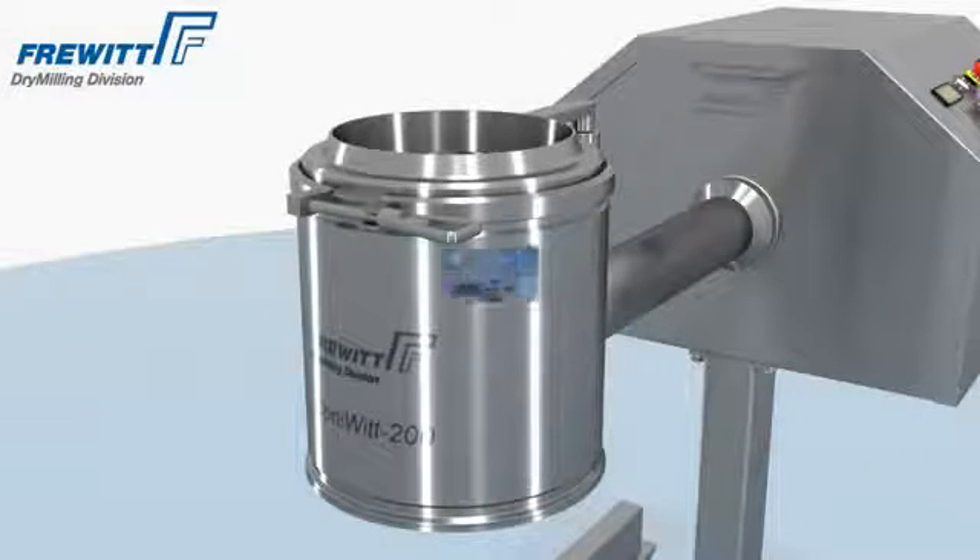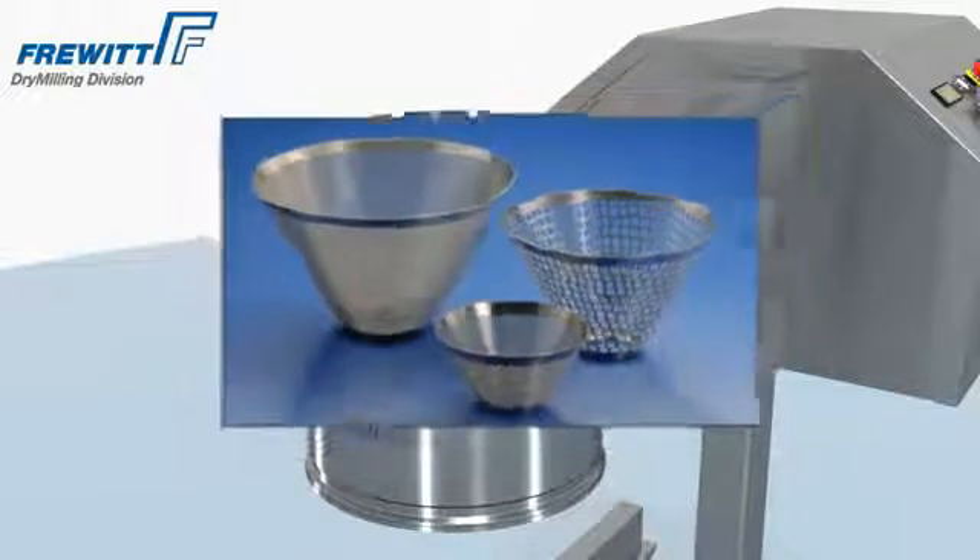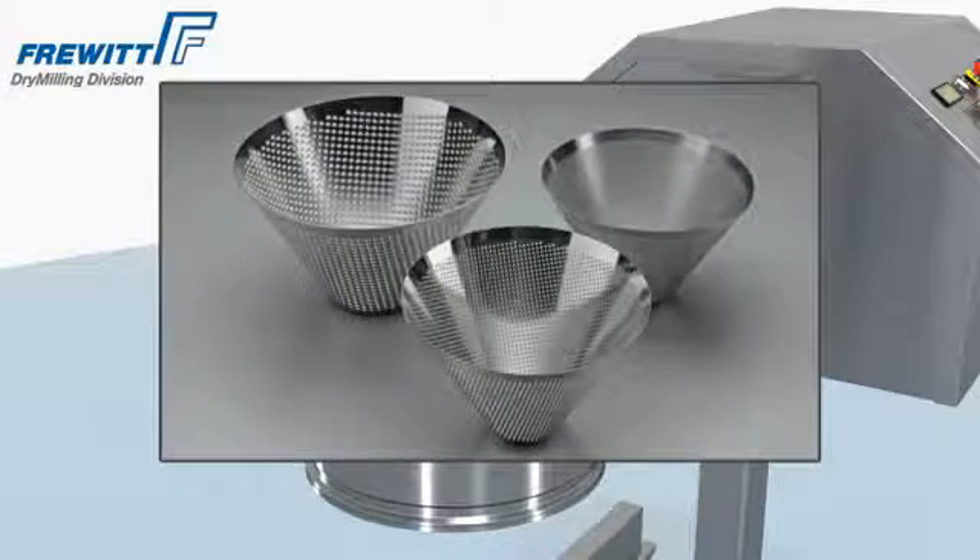A vast choice of sieves and rotor types ensures nearly every activity in the pharmaceutical, food, and fine chemical industry.